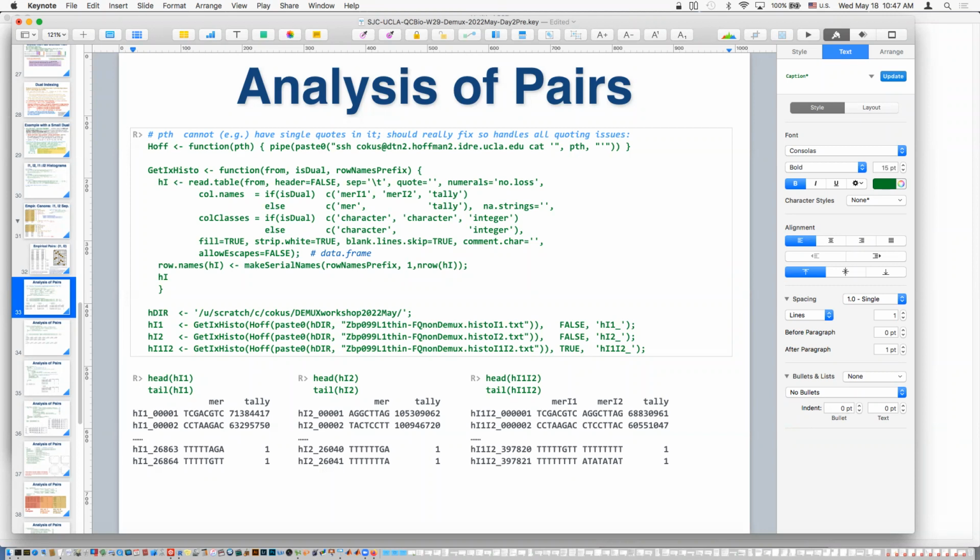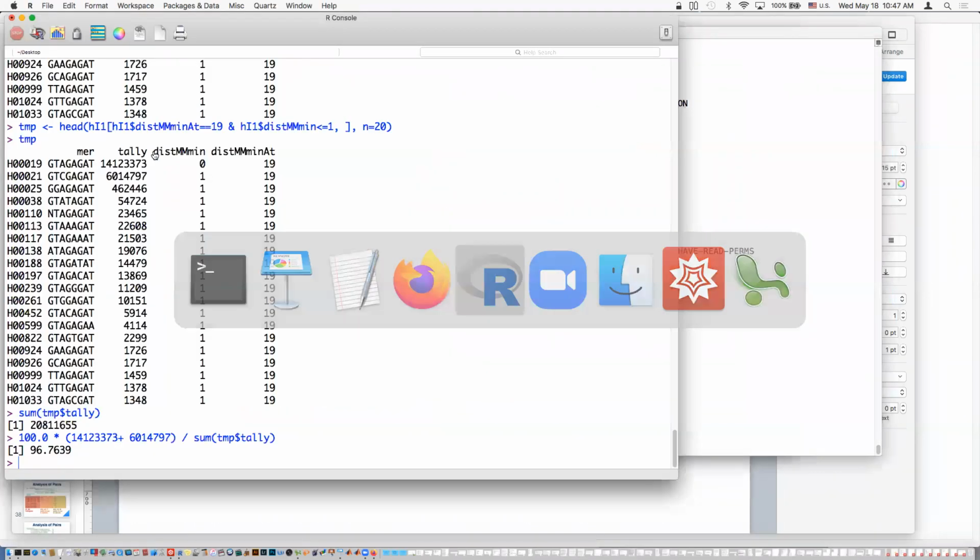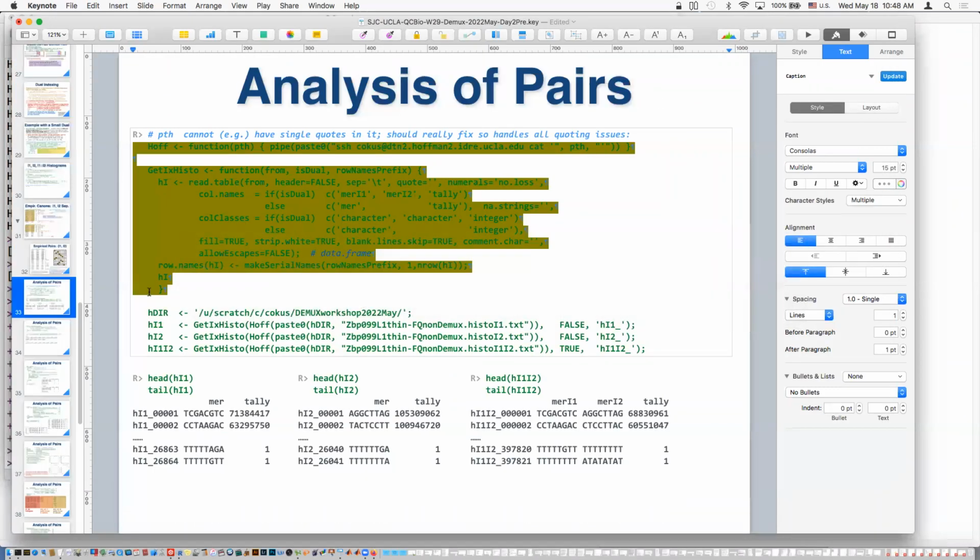Here's the I1 histogram and the I1 canonical list, go do your business. Here's the I2 canonical histogram and the I2 canonical list, go do your business. Then we can run the code twice without copying and pasting or making hand edits. That's all we're doing here, just setting up some functions to make the repetition easy. And of course, we have to load the data.